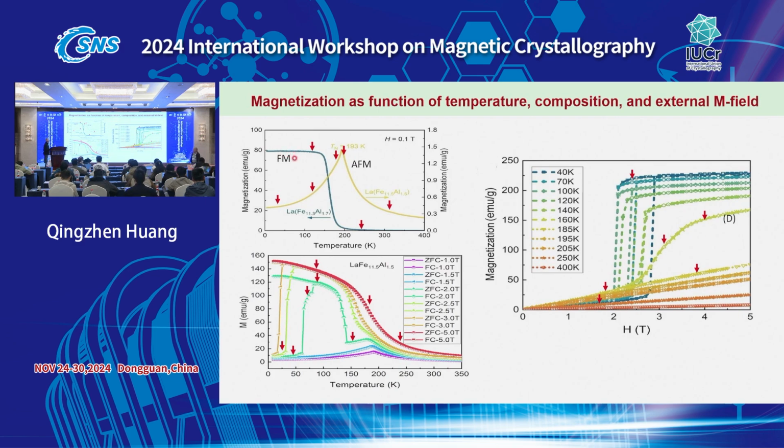Normally in this curve, if it's first order, it changes quickly, or if it's second order, the curve will start to go down, go down, go down like that. So you also need to collect data where it is fully saturated. This curve is called MH.